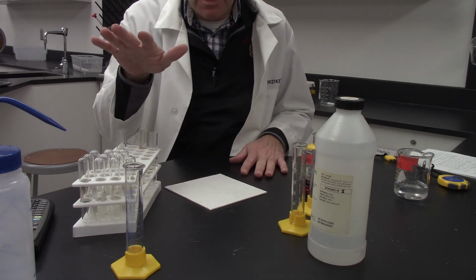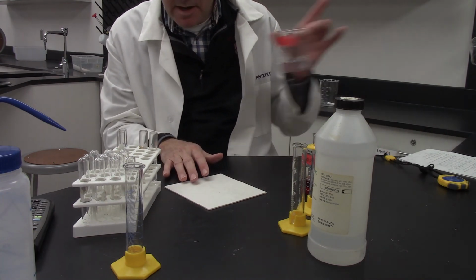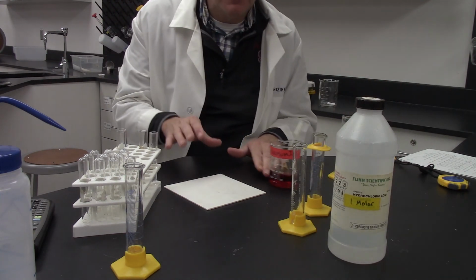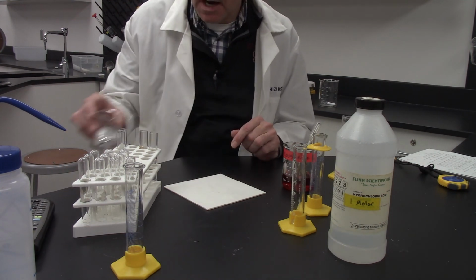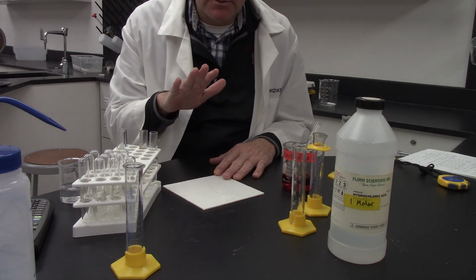So here's what you need to remember. You're going to mix acetone, iodine, 1 molar hydrochloric acid, and water. The reaction is going to go until it all fades out. That means all the iodine is used up. I will give you the data in the lab, and we'll go from there.